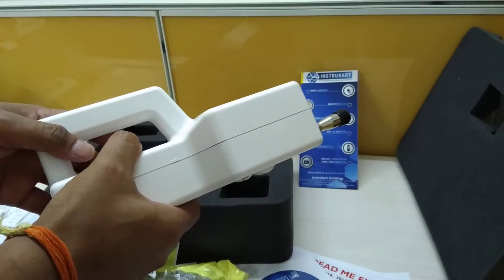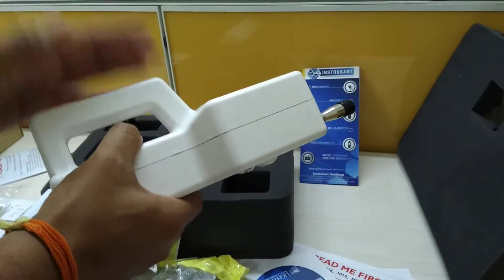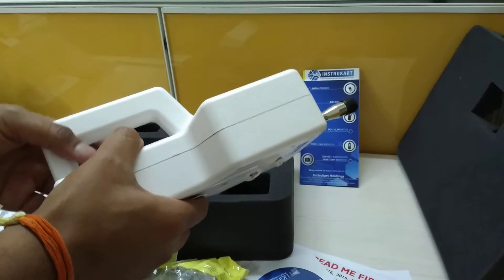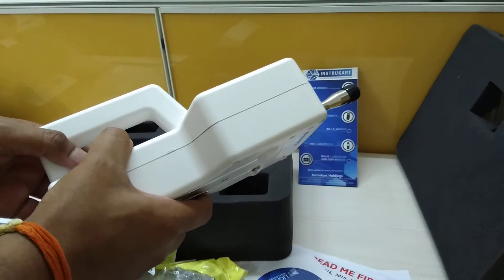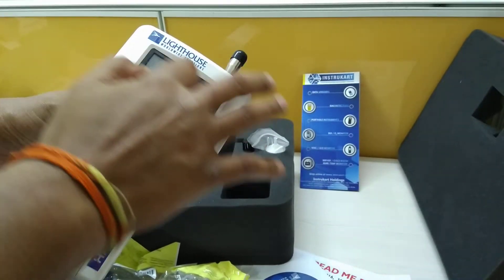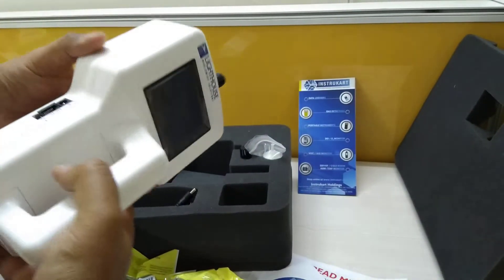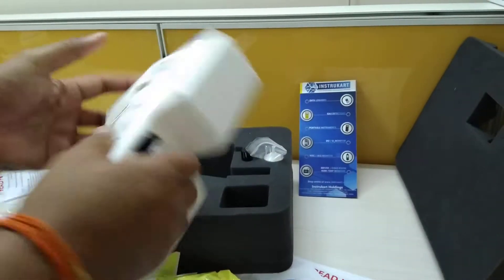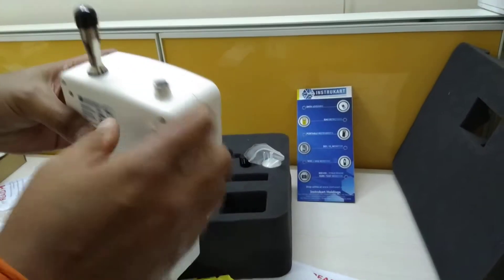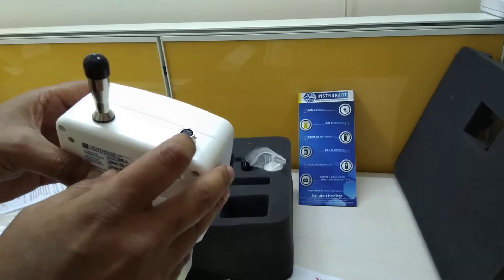It supports up to six channels of simultaneous recording and is compliant with 21 CFR. It also features a 3.5-inch color TFT screen and RS232 connectivity via RJ45 to PC.